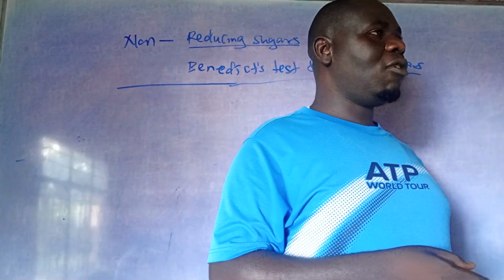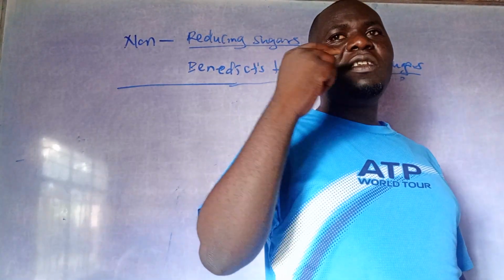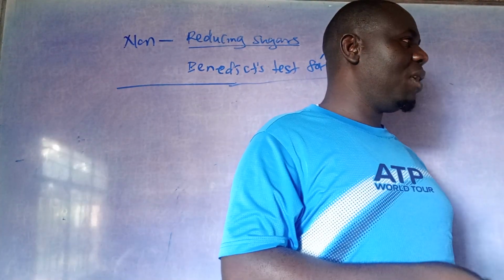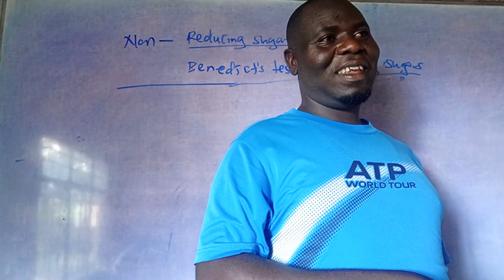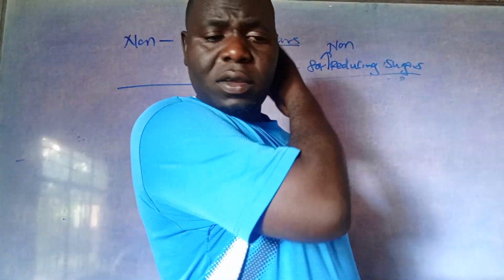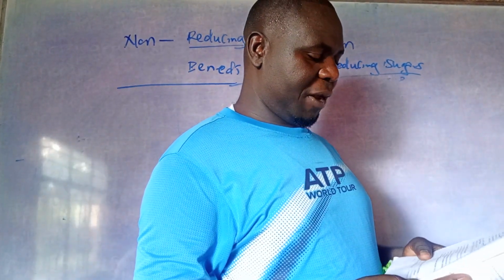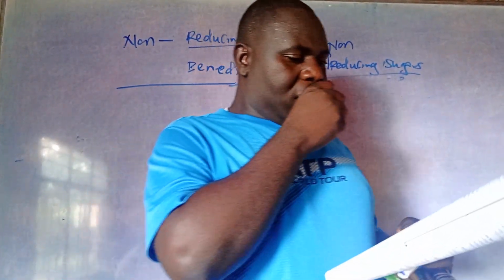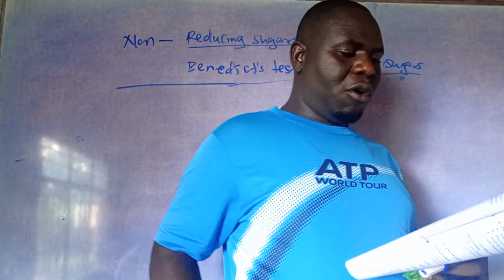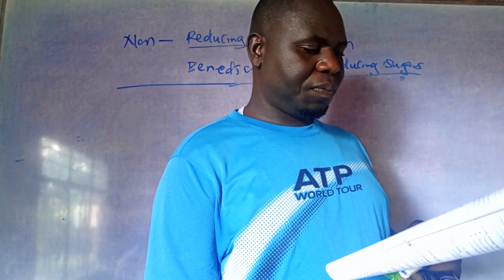Then from there, you add the Benedict solution, which is 2 cm³. Then you observe, step by step. So after observing, let us see what will happen in the table. The possible observations and corresponding conclusions are given in the table below.